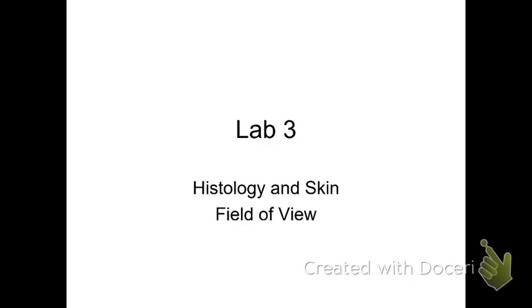Welcome to Lab 3. This video will help you prepare for all of the things that you'll be learning in the lab this week. This is going to include an introduction to histology. Recall that histology is the study of tissues. In this lab, you'll be learning to recognize 20 different tissues. We'll also be taking a quick look at basic structures in the skin and also introduce a microscopy technique and topic called the field of view.